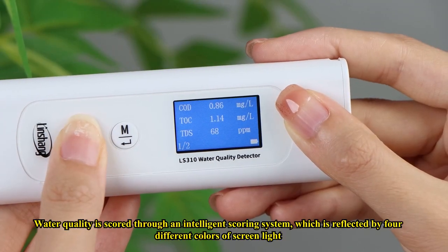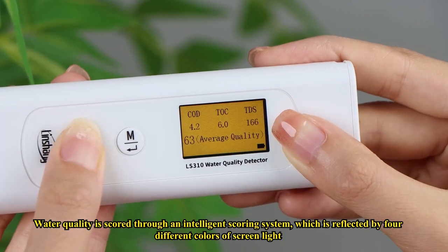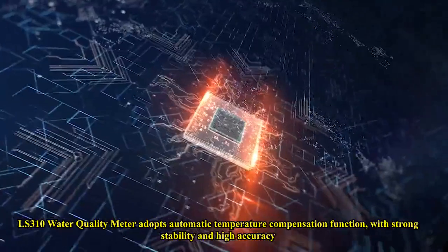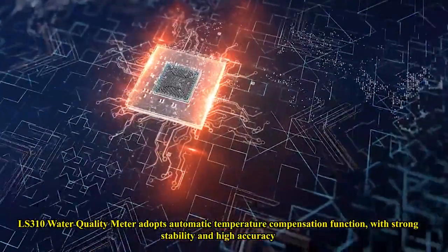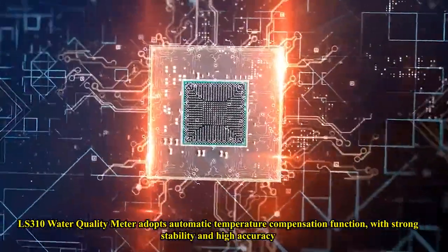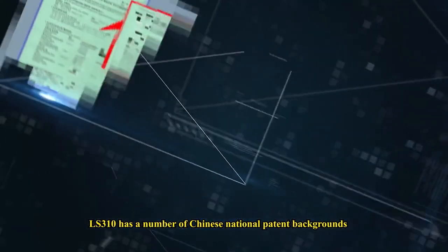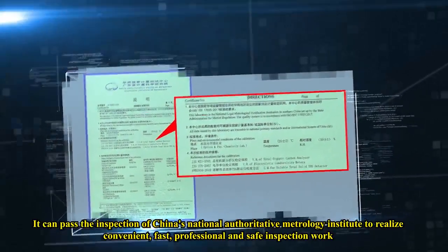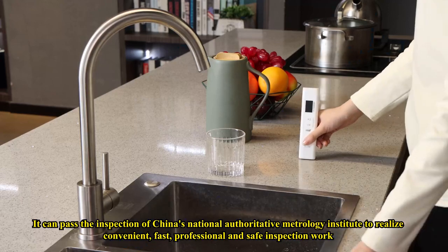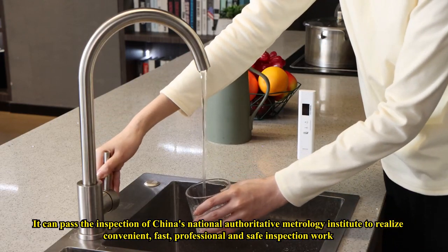Water quality is scored through an intelligent scoring system, which is reflected by four different colors of screen light. The LS310 water quality meter adopts an automatic temperature compensation function, with strong stability and high accuracy. It has a number of Chinese national patent backgrounds and can pass the inspection of China's National Authoritative Metrology Institute to realize convenient, fast, professional, and safe inspection work.